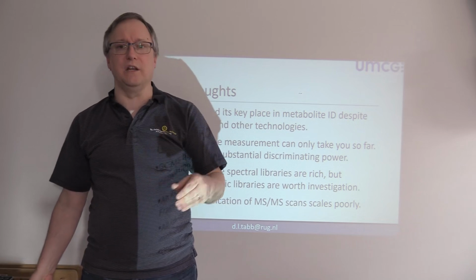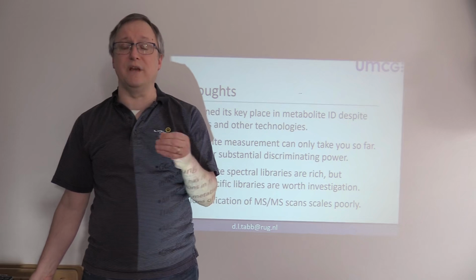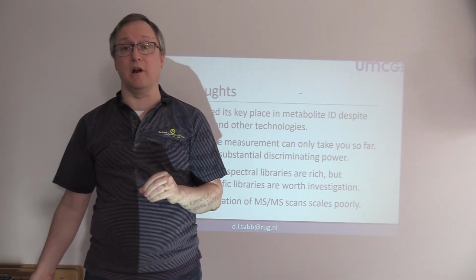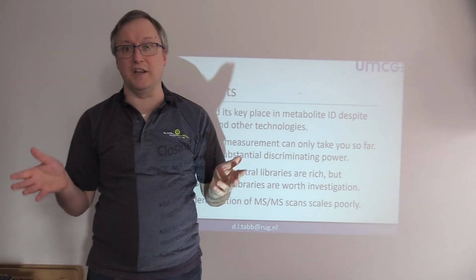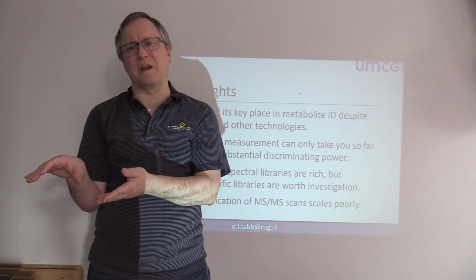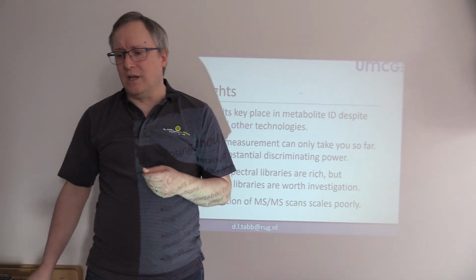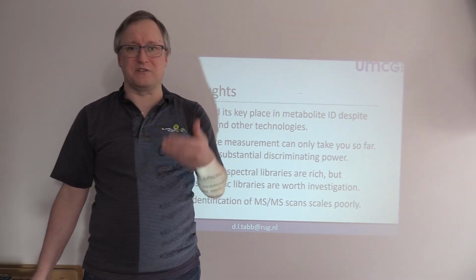So if you're dealing with something like lipids in particular, it's probably going to be of great benefit to you to use a lipid-specific spectral library, not to use those that are attempting to identify just anything out there. And frankly, it doesn't make a lot of sense. If you have mass spectra of lipids, why would you compare them to spectra of carbohydrates? Doesn't necessarily make sense.